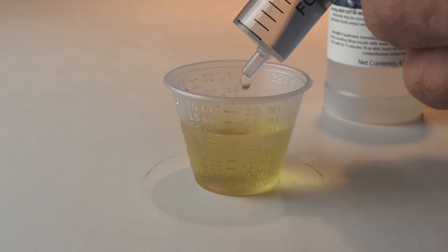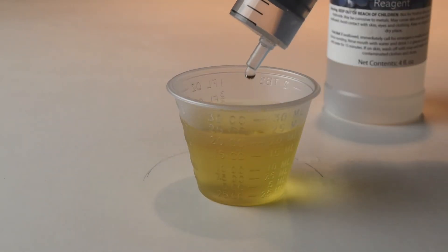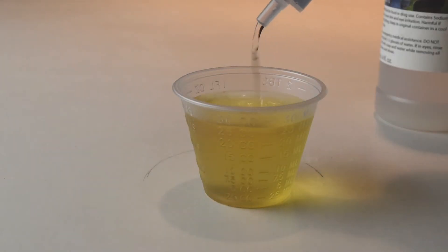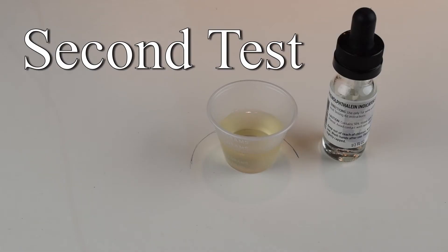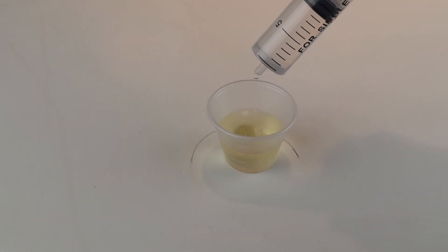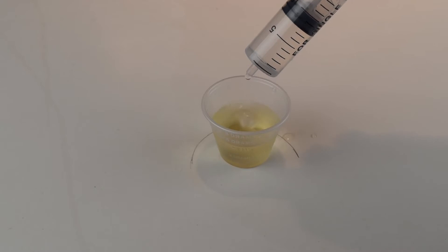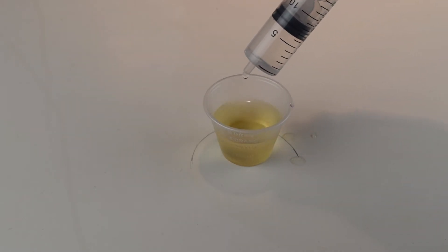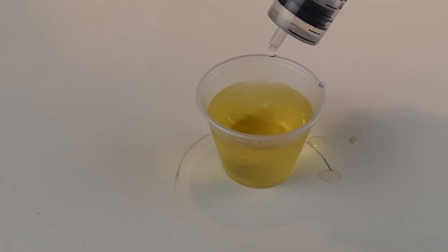Except I didn't notice any color change when running this first test. So I tried a second test: 15 milliliters of wine, three drops of phenolphthalein, slow addition of sodium hydroxide. I added and swirled, and added and swirled, and ended up adding all 10 milliliters of the sodium hydroxide solution without seeing any color change.